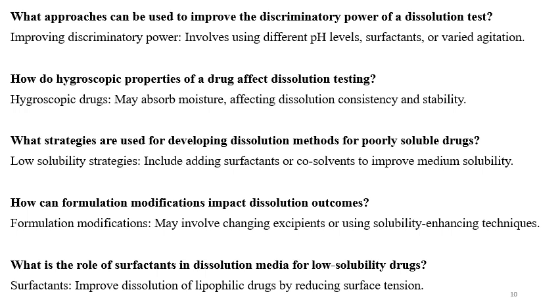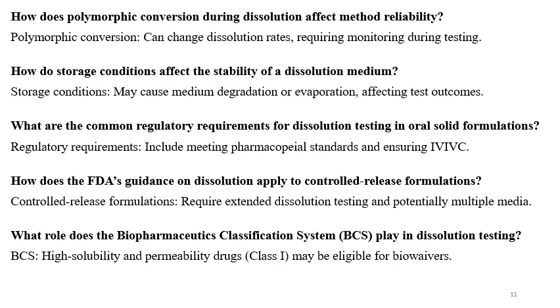What is the role of surfactant in dissolution media for low solubility drugs? Surfactants are generally used, like SLS, Triton X, Tween, P80. These improve dissolution of lipophilic drugs by reducing the surface tension and improving the wetting.